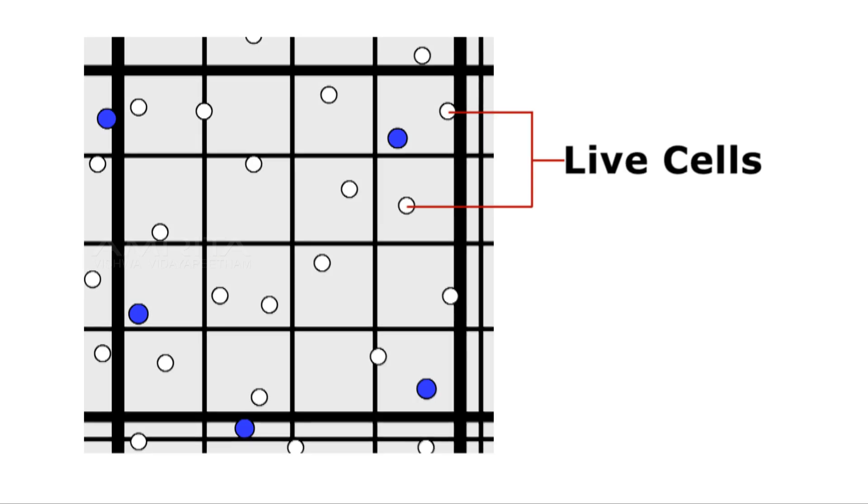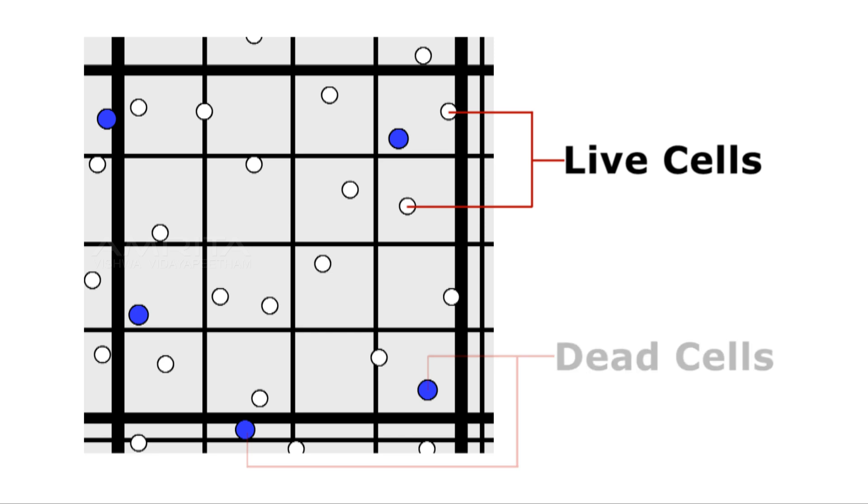Live cells appear colorless and bright or refractile under phase contrast while the dead cells stain blue and are non-refractile. Keep a separate count of viable and non-viable cells.